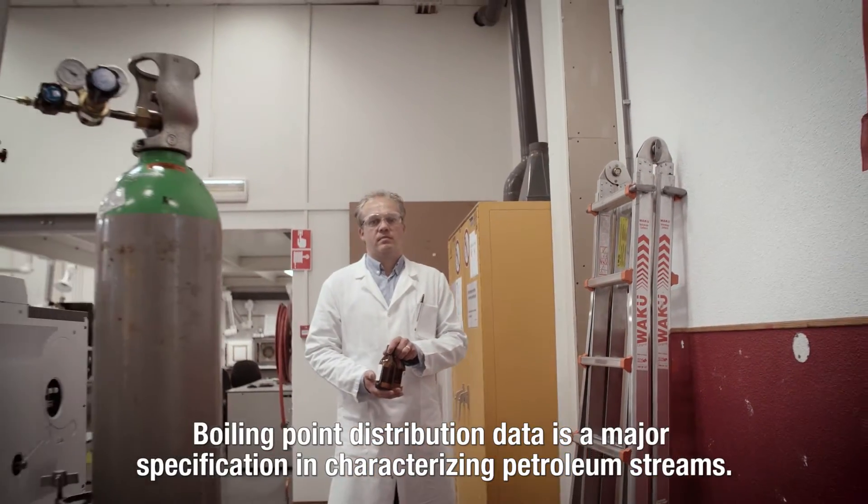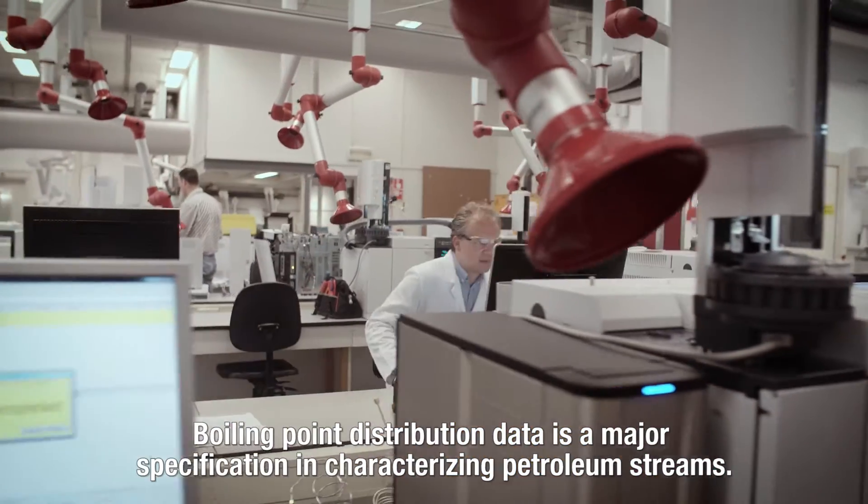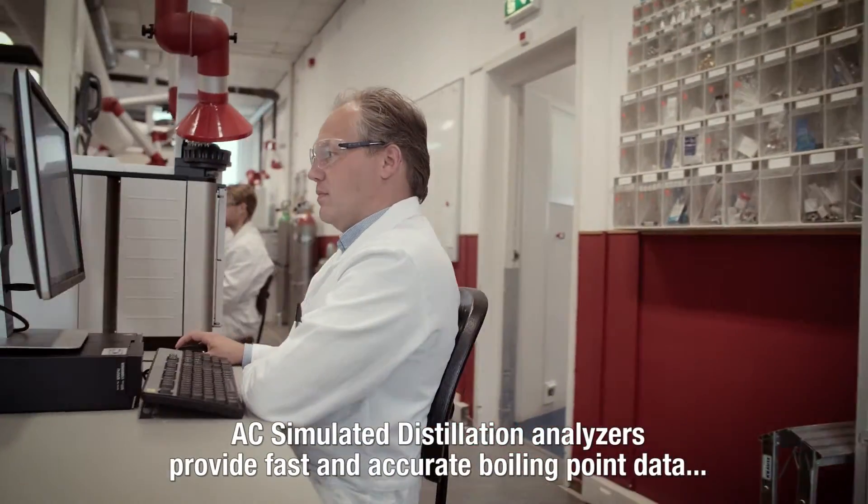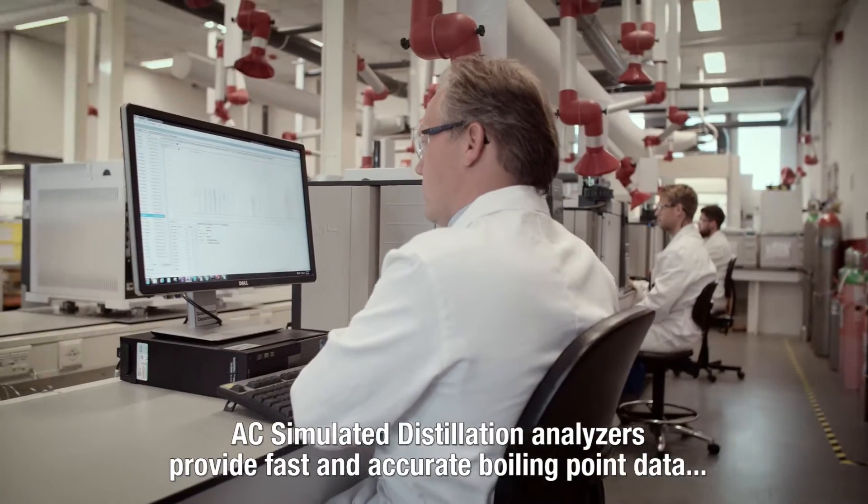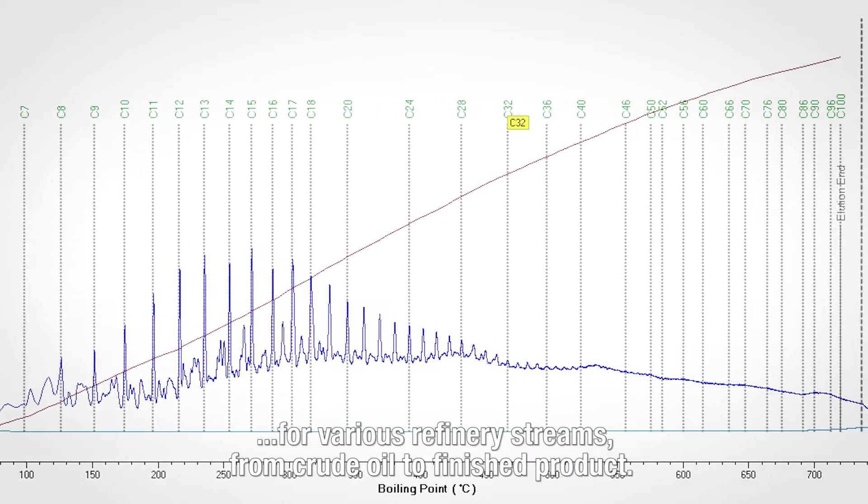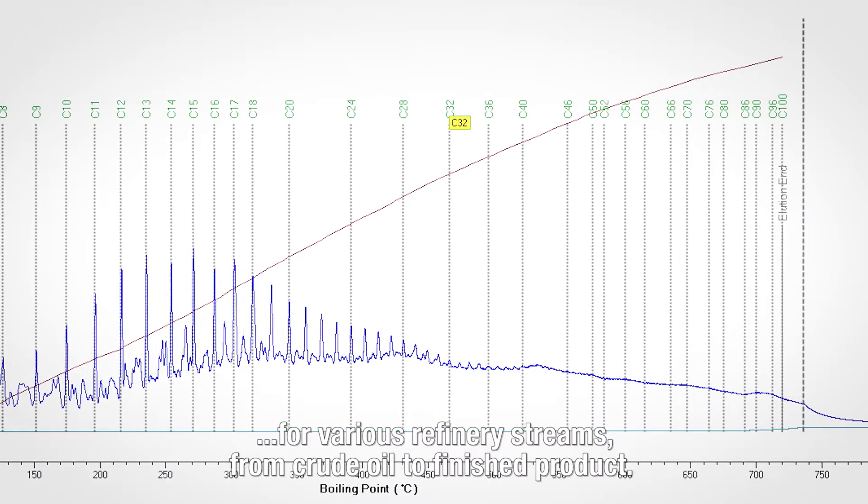Boiling point distribution data is a major specification in characterizing petroleum streams. AC simulated distillation analyzers provide fast and accurate boiling point data for various refinery streams, from crude oil to finished product.